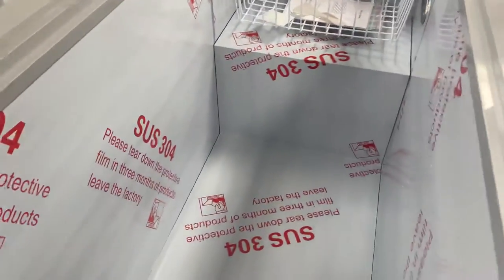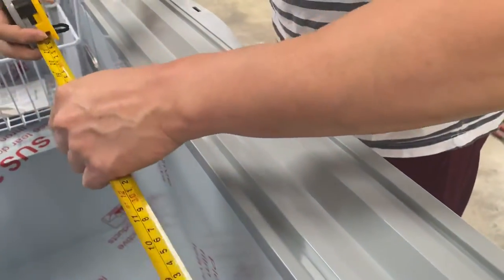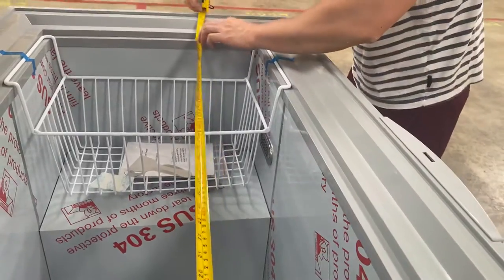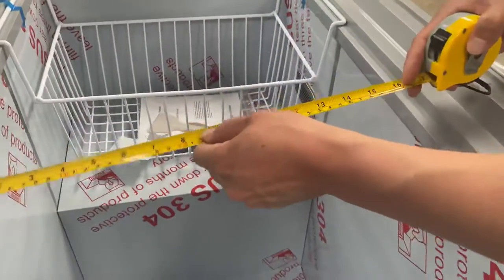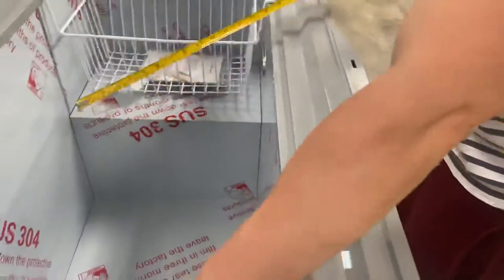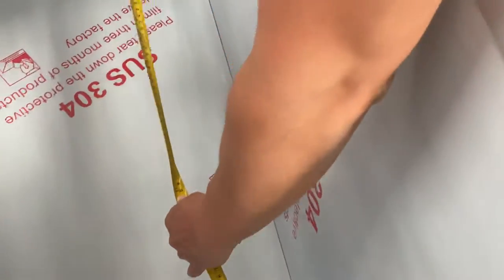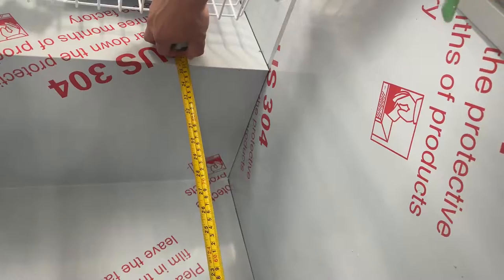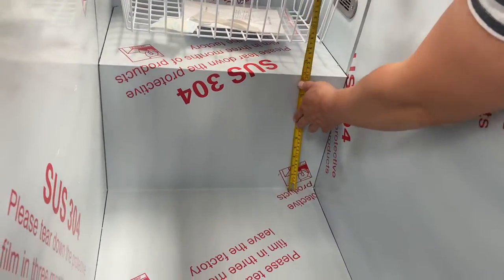This is the main storage compartment. The interior height is 23 and a half inches tall, the interior length left to right is 47 inches, and the depth is 18 and a half inches. In the bottom area, the length from the left wall to the right step is 35 and a half inches, and the height of the step is 12 inches tall.